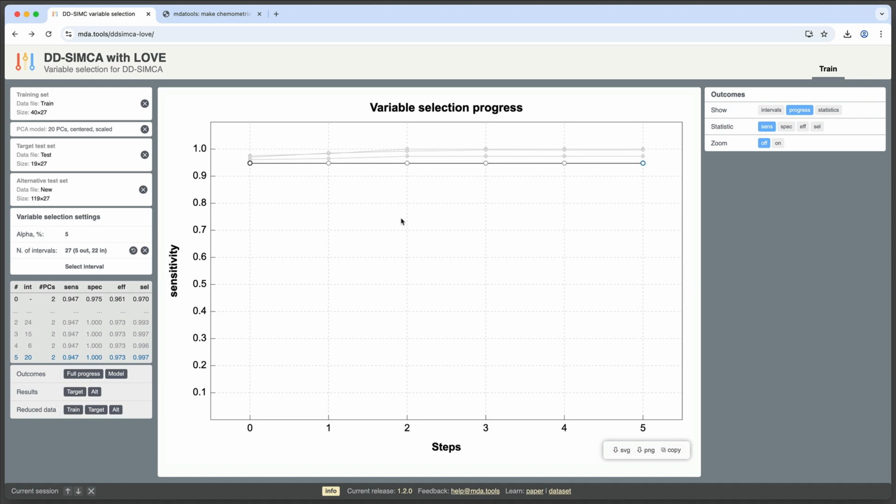I will make it very fast. I will just increase the speed of the video. There is nothing specifically important in this process. And then when I reach the end, I will get back to you and explain what you can do more.